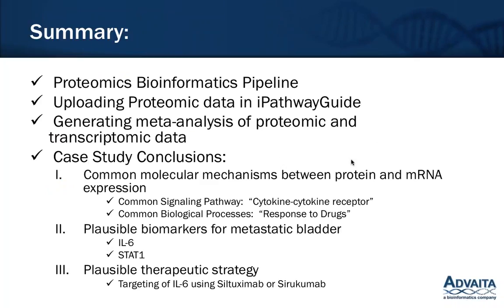So in summary, I have gone over the proteomics bioinformatics pipeline with you, where I showed you how a proteomic study comes about starting from a cell or tissue. And I showed you how you can upload protein expression data into iPathway Guide. We accept 2 file formats, the SciEx SWATH file format, as well as the custom tab delimited text file for any other instrument that is not a SciEx SWATH instrument.